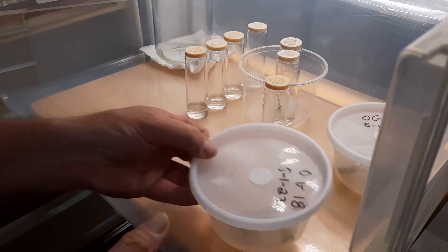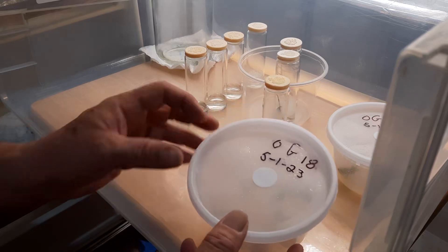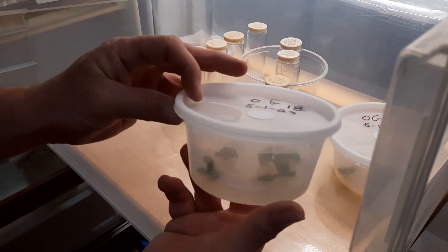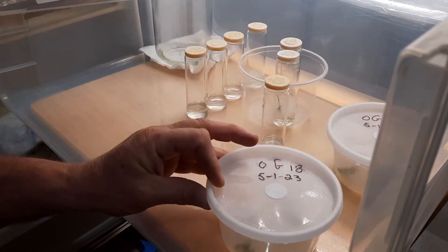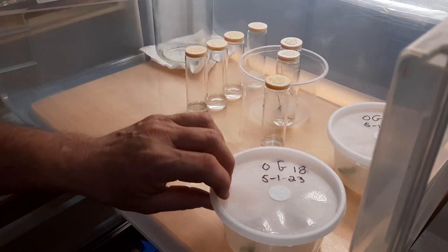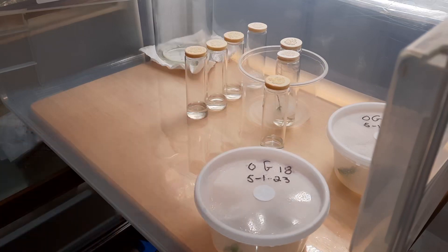What I got here is OG-18, taken about three weeks ago, and it's just got some — what looks to me like — yeast contamination. I haven't opened it up yet.